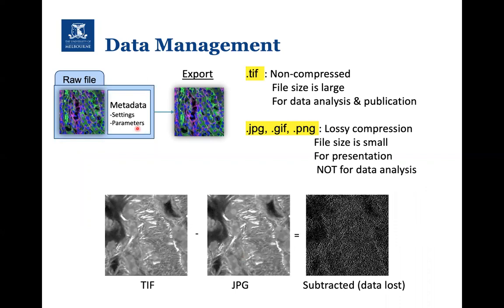Next thing is, if you are going to export your data out, then we suggest that you save it as a .tiff file. This is a non-compressed version of your original image file. So the file size is large and it is mostly useful for data analysis and publication.